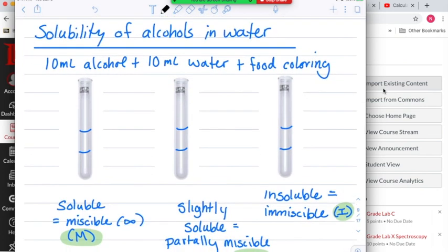The reason we don't use methanol too often, well, I should say we use it when we want to, is that it's very, very flammable. So sometimes when we're doing demos, it actually is a great liquid to use because you could really light something up with it, but it is a very dangerous one. The other ones are safe to use in the lab, and that's why in this lab we wouldn't give you methanol. I know, boo. It is actually a lot of fun to light it up and see the big blue flames.